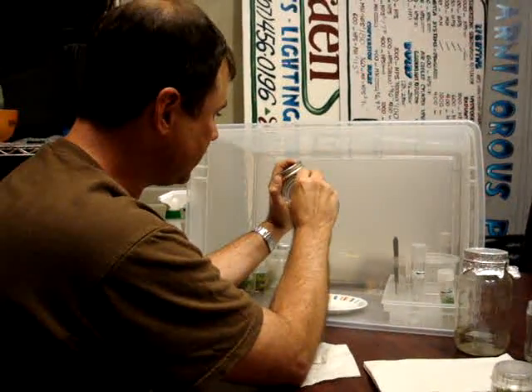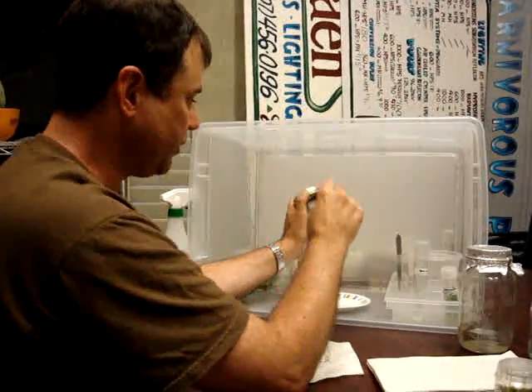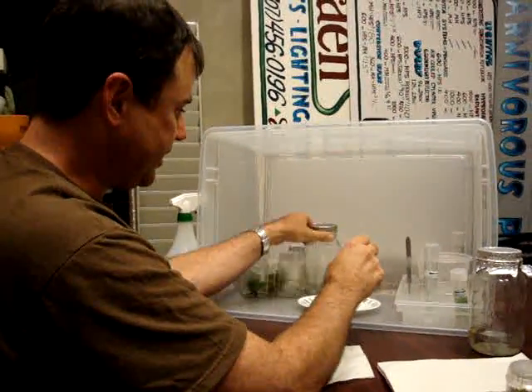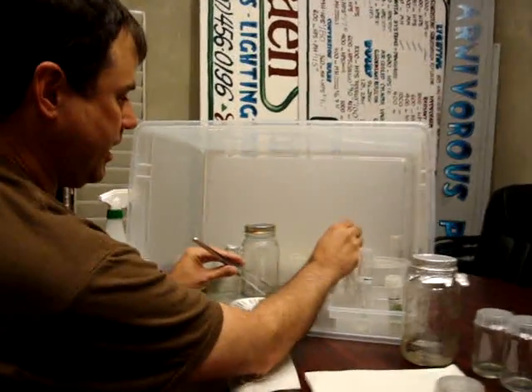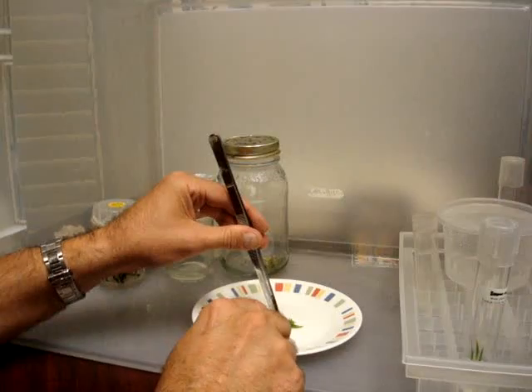I'm fishing around in here for the peppers. This was our pepper — here was our big pepper cutting right here. Let's take this guy, and I'm going to reach over for my scalpel.